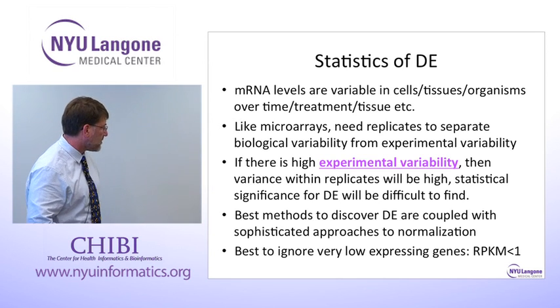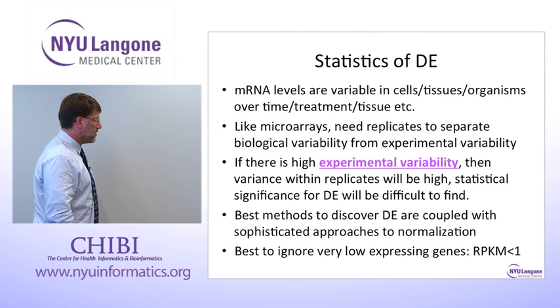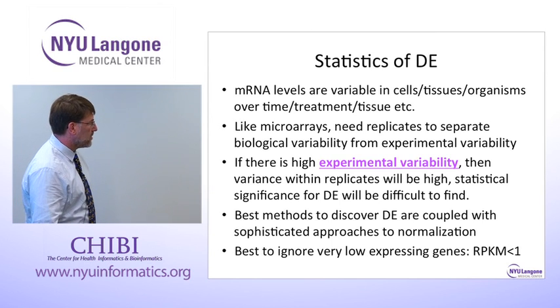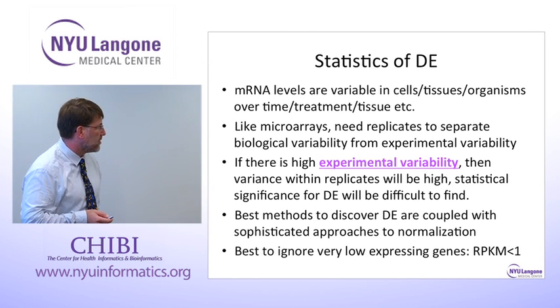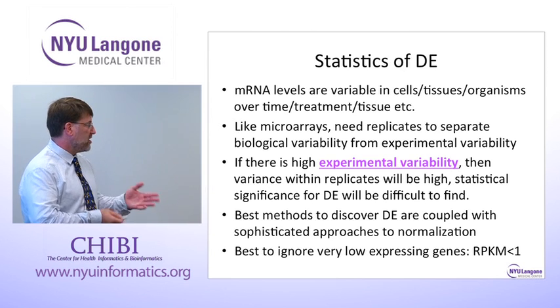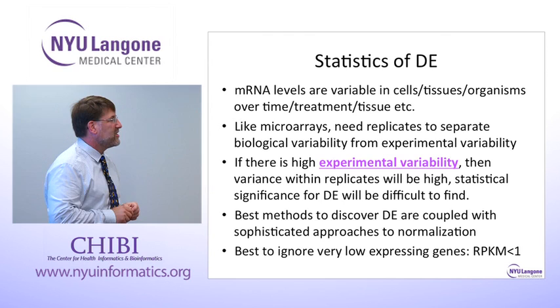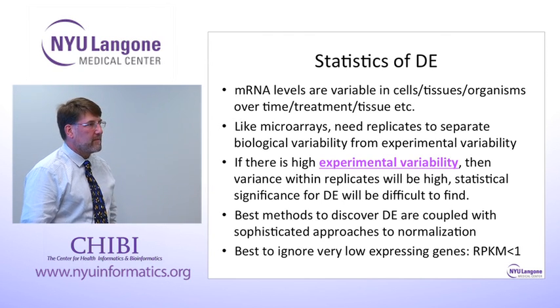Yeah. In terms of estimating the messenger levels, the transcriptome of genes that we know of between the two systems, the new one, deep sequencing, and the previous microarrays, that maybe suffer less from all these normalization issues. Well, what do you recommend for a lab that's just interested in a few genes into the genome, the transcriptome? I mean, not the full transcript, just the genes. Which genes? Just a few genes or all of them? Coding genes. So you're talking 20 to 50,000 different transcripts, right? Right. Everything that's covered by the typical Affymetrix.